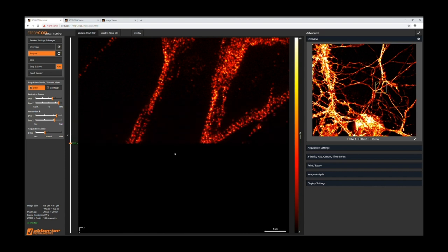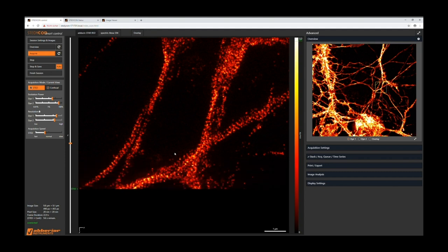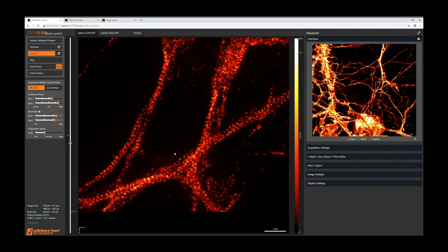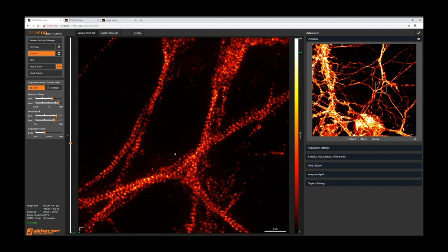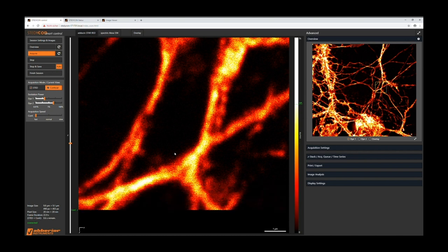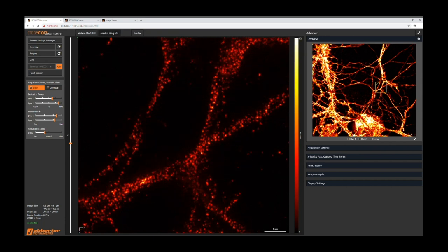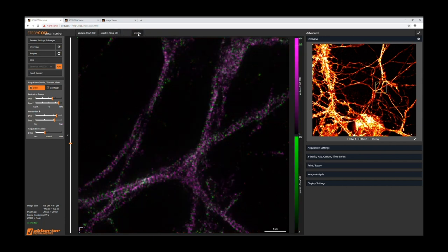So that's all it takes. You choose three settings: excitation laser power, resolution — which is the STED laser power — and it automatically also sets your pixel size and acquisition speed. Now you really nicely see these regular pattern structures for the spectrin, which are at a spacing of I think 190 nanometers, which you could not see in the confocal image.